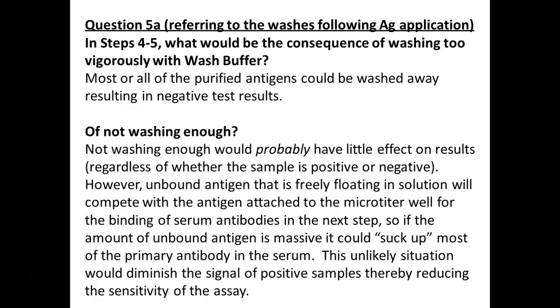We will probably still get positive results, but they'll not be as strongly positive as we would have preferred. And this test can be done quantitatively, which means we could actually put it on a spectrophotometer and get a number for the amount of color that is generated. We're not going to do that today. We're just going to see if we get positive or negative, right? We're just going to be qualitative instead of quantitative. We're not going to get a number.